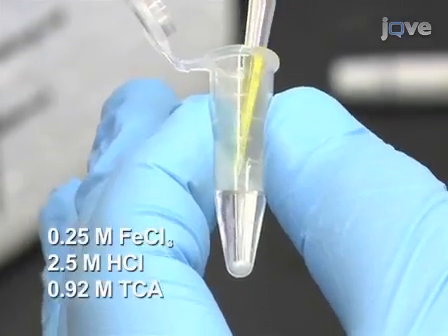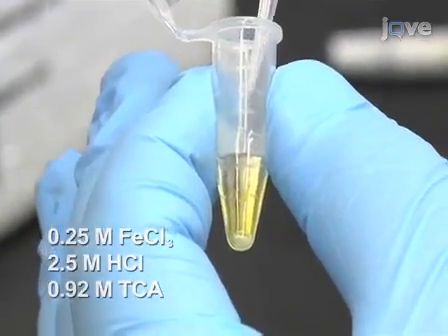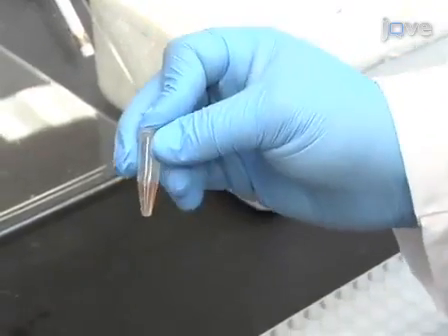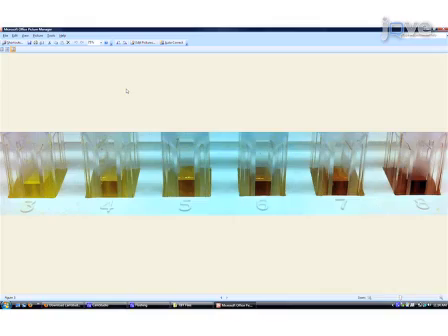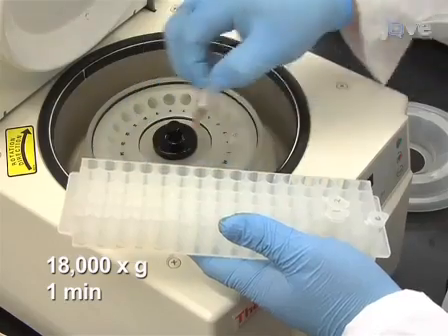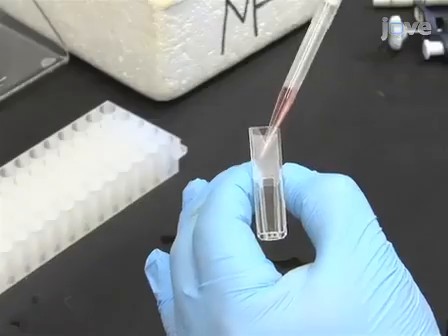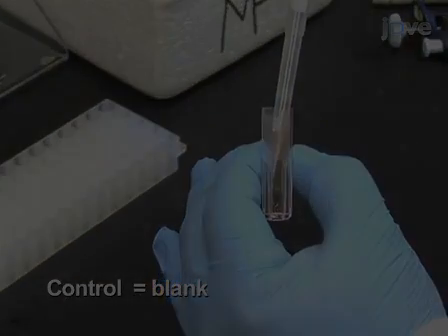Then add 100 microliters of development solution. Mix by shaking 3 times and allow color to develop for at least 1 minute at room temperature. Centrifuge the samples, then use plastic cuvettes for the spectrophotometer.